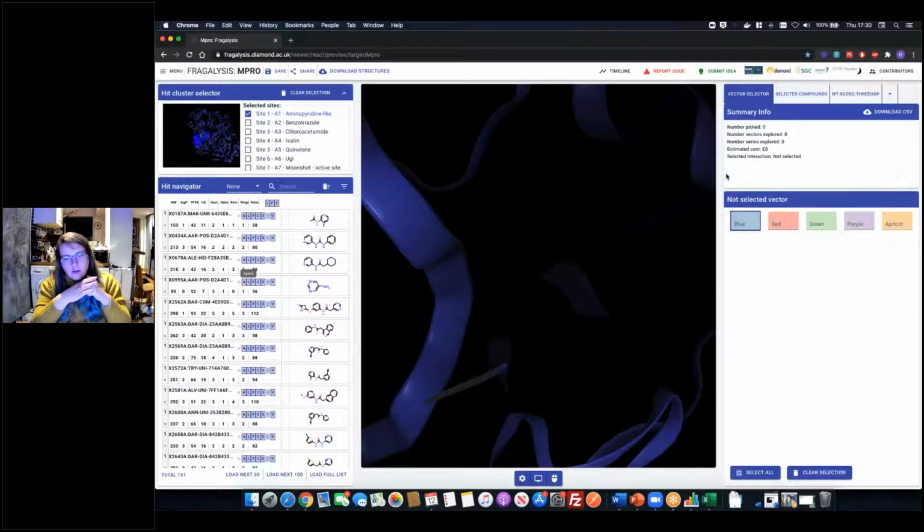And what that comes down to really is a lot of hardcore algorithms. So there are different algorithms. You might want to do some simple docking, you might want to do some MD simulations. Whatever it is, the main thing you're looking for out of that is a 3D structure, and also some sort of indication of score or a metric that you can quantitatively use to help you narrow down your selection.